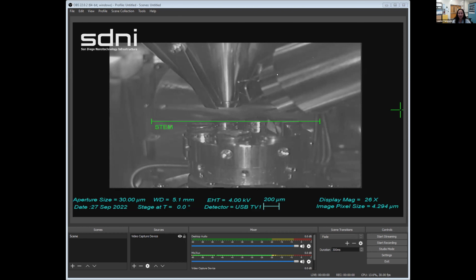Okay. So Zachary kind of gave us a little overview of why the SEM is better as opposed to the optical microscope. But yeah, just to refresh real quickly, the optical microscopes, which are the ones that are commonly seen in classrooms, see at best 1000x resolution. And at best, the cone-shaped cells in human eyes can only detect wavelengths from 380 to 700 nanometers. This gives us a light resolution of around a micron or a couple microns.